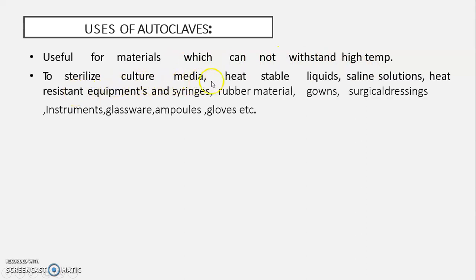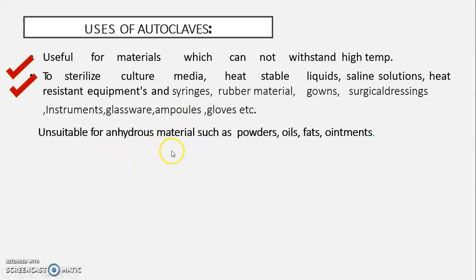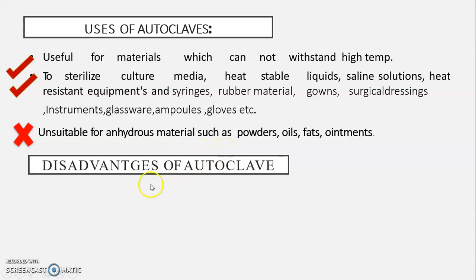To sterilize the culture media, heat stable liquid, saline solution, heat resistant equipment, and syringes. Rubber material, gowns, surgical dressing, instruments, glassware, ampoules, and gloves. Unsuitable for anhydrous materials such as powders, oil, fats, ointments.